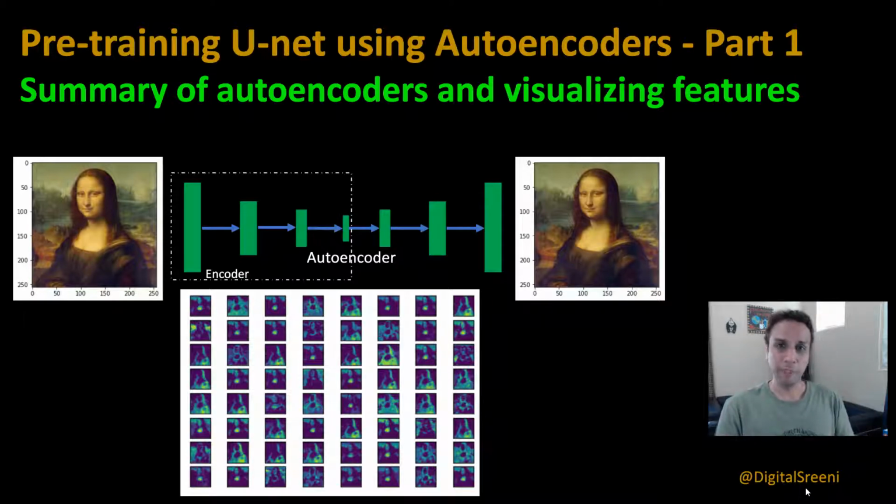What do I mean by that? Now you have, let's say, hundreds of electron microscopy images or some images, right? And you know that in future you'll keep working on these, and then you're trying to train a model. It makes sense for you to put some time ahead of time in generating the initial weights. Instead of starting with random weights, start with weights that have been trained on your own data. This is exactly what we are talking about.